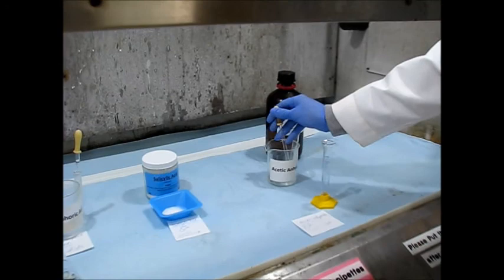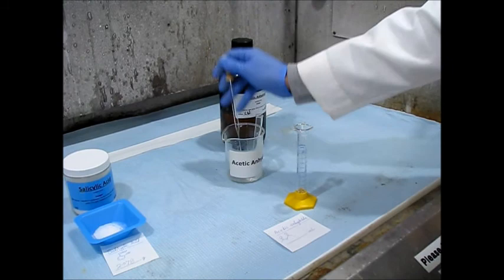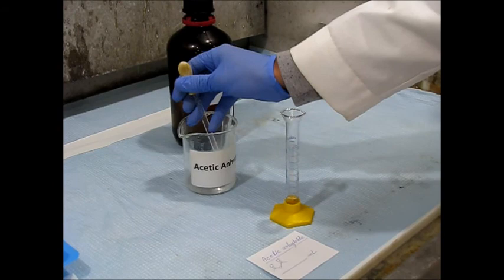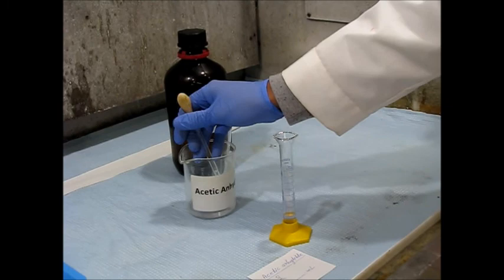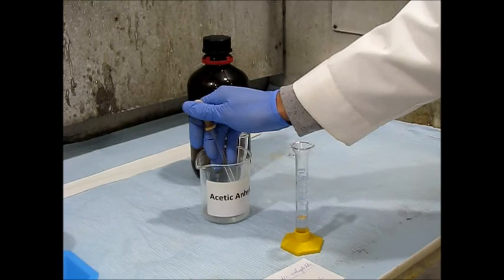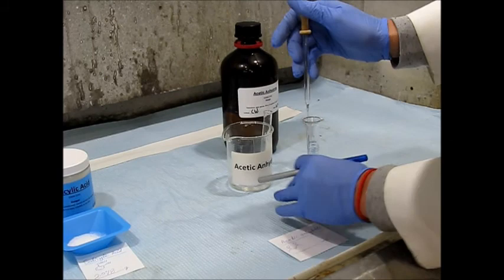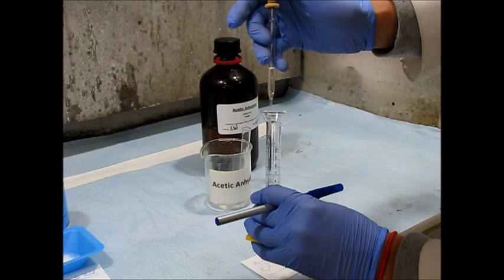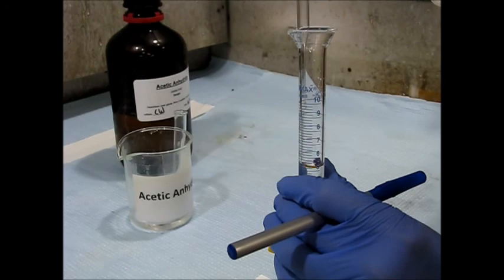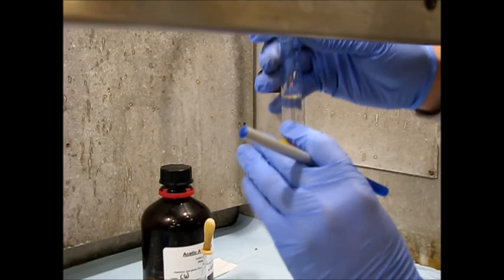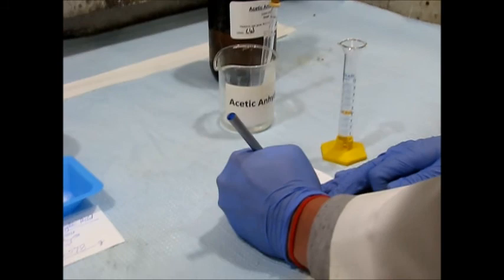So first we're going to get five milliliters of the acetic anhydride. So we're just over four. Awesome. So we have just about 5.1 milliliters.